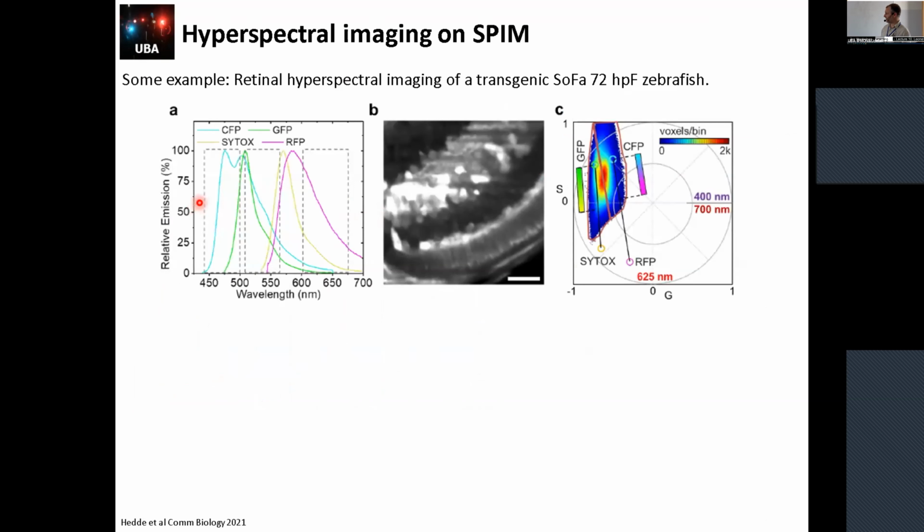You can see that basically the overlapping of the fluorescence is very, very high, which really compromises the possibility of splitting by channels. And to complicate our life, we also put an extra marker, which is a marker for the nucleus.